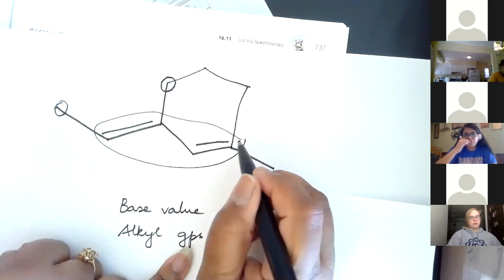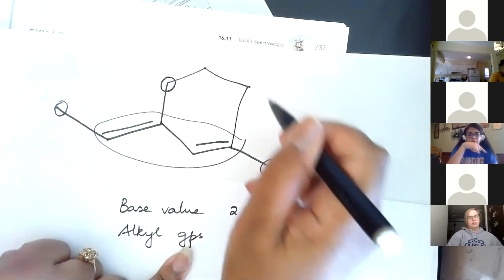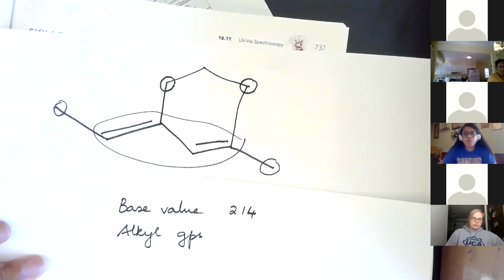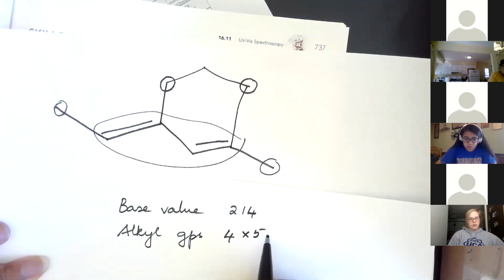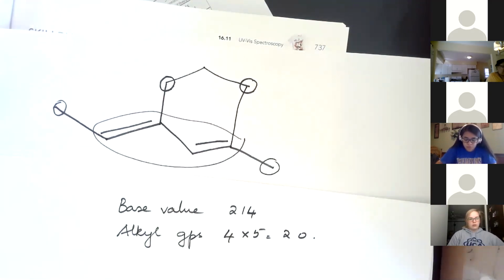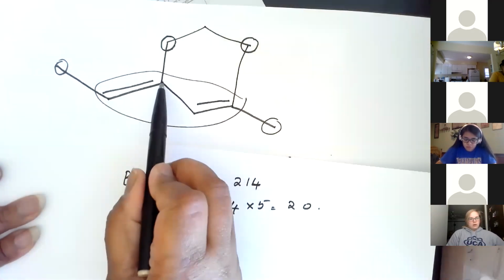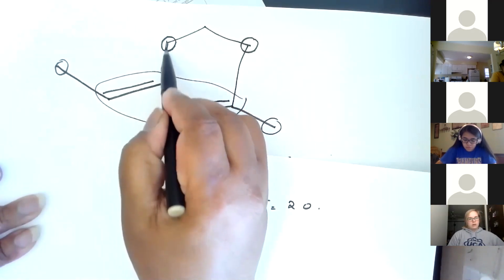And 2. That one. And 3, and then 4. That one. Okay. Everybody with us? So that's 4 times 5, 20. The exocyclic is easier to see here. So this is your main ring.